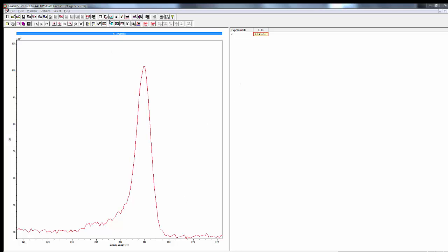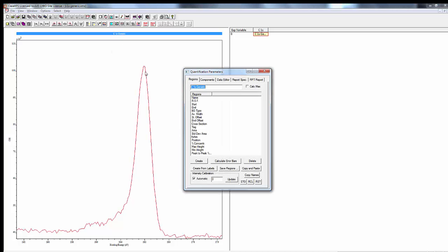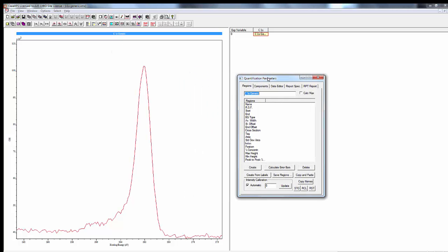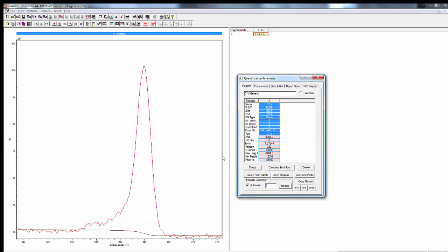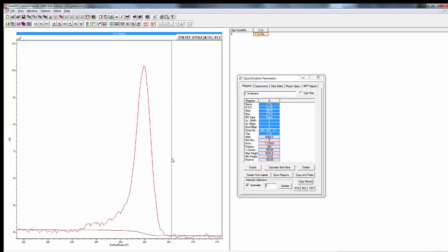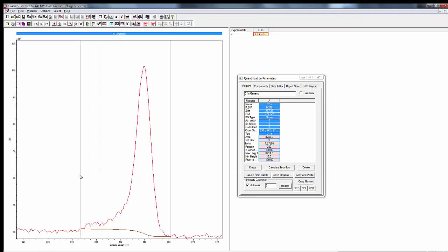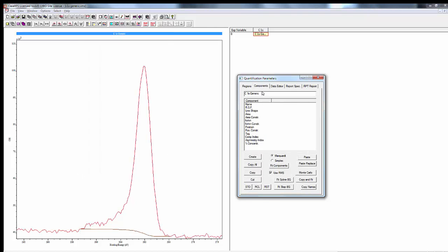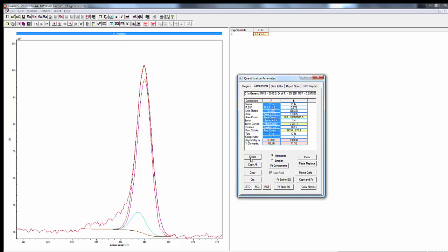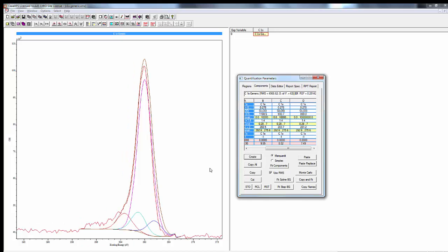The first step is to go into our quantification parameters box and create a background under regions. Generally use a Shirley background and set the endpoints for the background. Then under components, create a component and then three more and move those over.